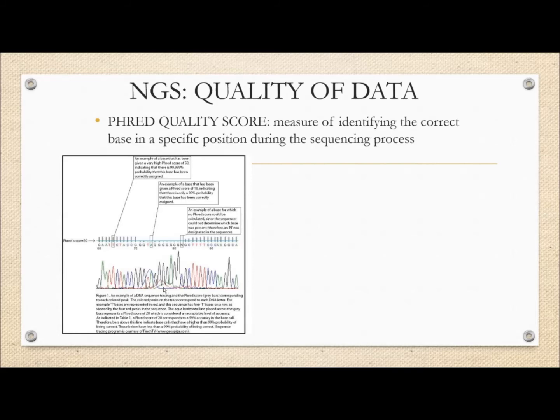That tells you it's a small probability, which means there could be something else. Now, while these are pretty strong G's, the next four are black peak, black peak, black peak, black peak. But for some reason, the probability of it being a T is pretty high. It's not non-existent, and that kind of tells you something. So there are different ways of looking at it. You can say, okay, you know exactly what these are, and the probability of it being anything else is pretty low. But somewhere in the middle, something happened during that experiment.